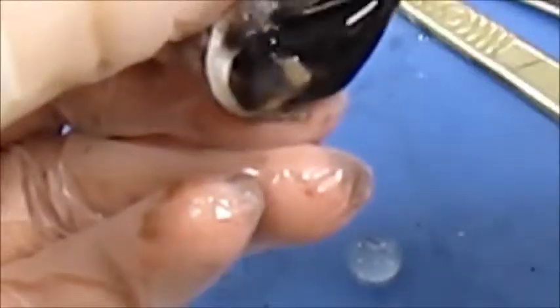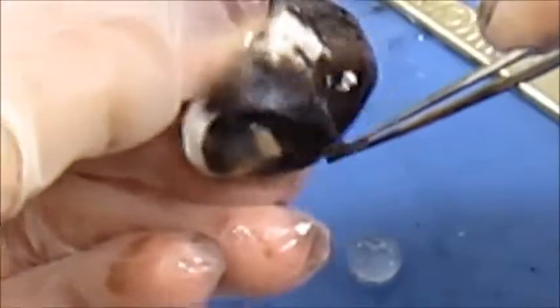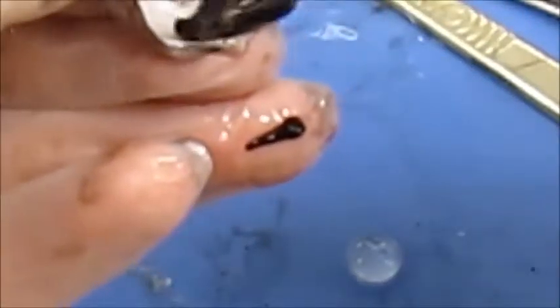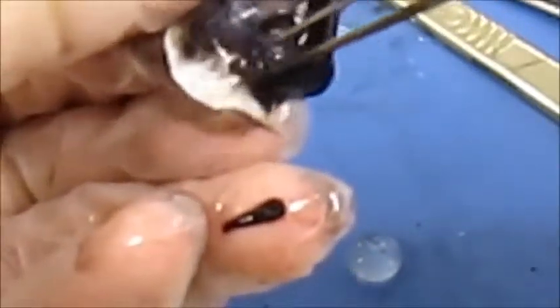This part of the dissection is recorded on my camera and so is very poor quality. You can see the black film called the retina at the back of the eye. This is full of light-sensitive receptor cells that detect the light signal entering the eye. All of the cells send their message to one point at the back of the eye, to the optic nerve.